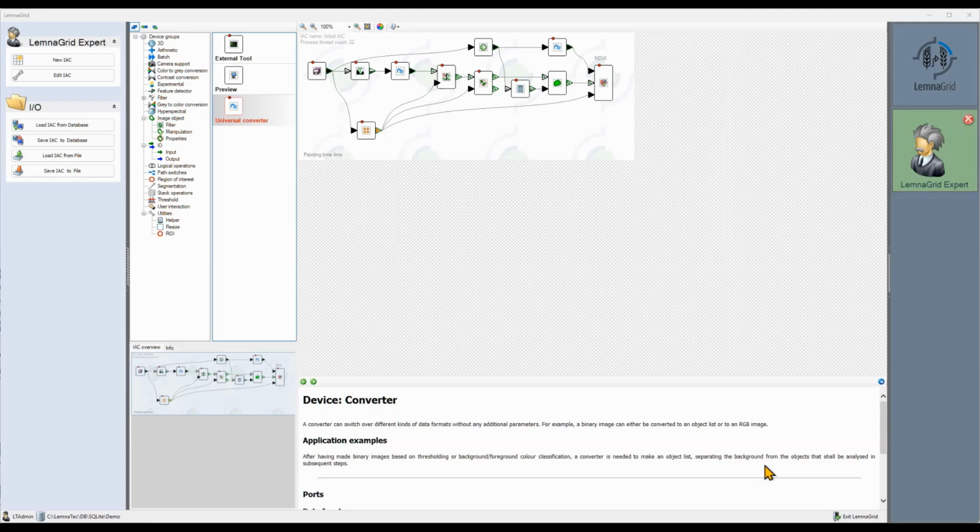We can do the same with all the outputs I have demonstrated from the Hypercube slicer. You may need to add multiple Hypercube slicers, but that's not an issue. We shall not forget to add names to the reader and the vessel configuration maker.